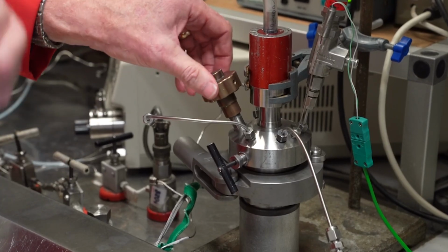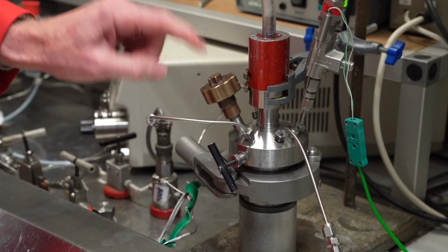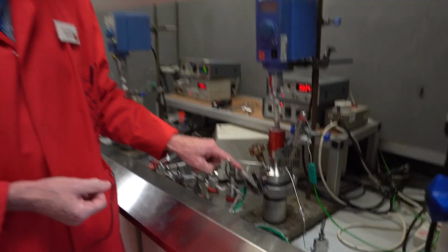And in our lab we've got something like 30 different autoclaves, but this key will only open up this clamp, so that we know that in every experiment we absolutely have control over which clamps are being used, which keys are present, and we can't ever open up the vessel with any pressure inside it.